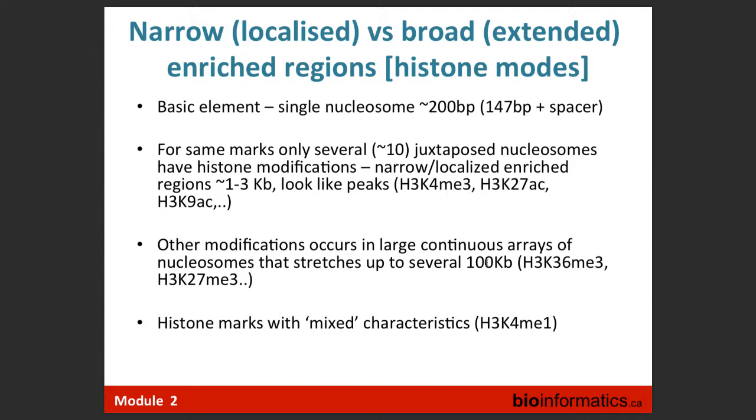What do you think is a major bias, or one of the major common determinant biases? Probably the specificity of the protein. Well, the antibody. Yes, of course, the specificity of the antibody and crosstalk between two antibodies. Say, I believe this is H3K27me3, but apparently the H3K36me3 mark will also be recognized, with say 20% specificity, by this antibody. And that's the curve which Martin showed, right? You saw that there is H3K4me3, which is the easiest antibody. It's 90% specific, I think. And still, it can pull down other modifications, but only a few percent. But if it's 30%, that's already dangerous.